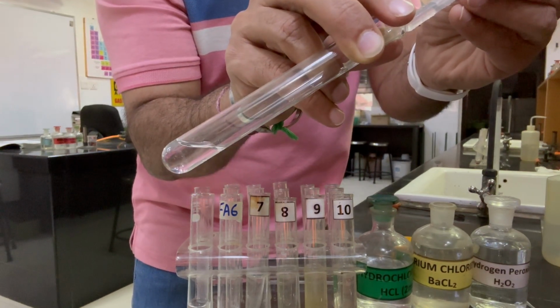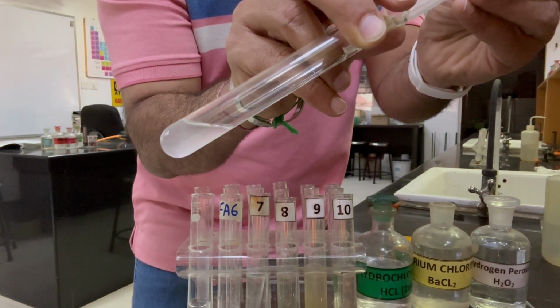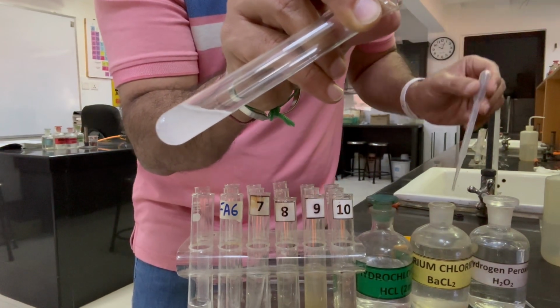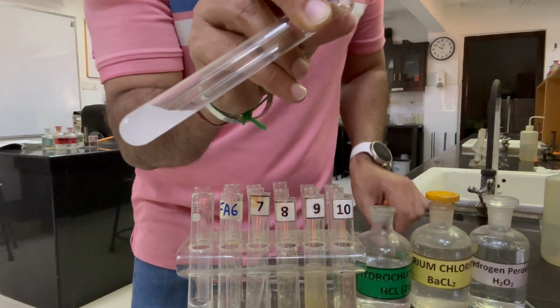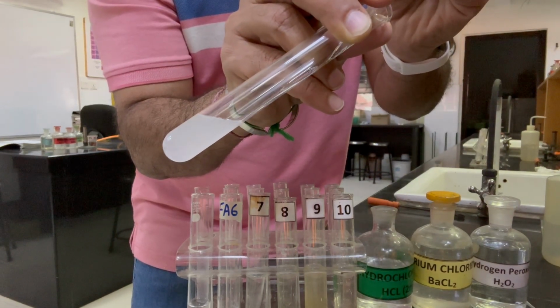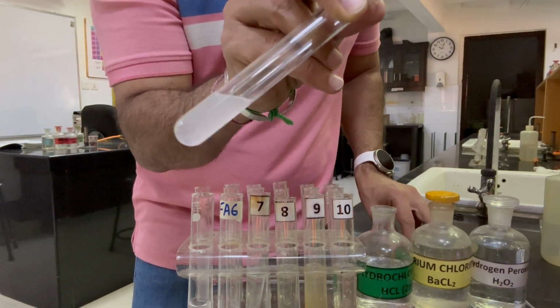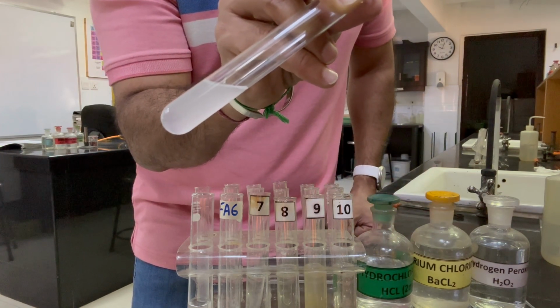As soon as we have added barium chloride, we can see white precipitates start forming. And now, if in the same test tube I add hydrochloric acid to confirm sulfate or sulfite, those precipitates are not dissolving. It means sulfite is oxidized to sulfate. Now we will record this observation.